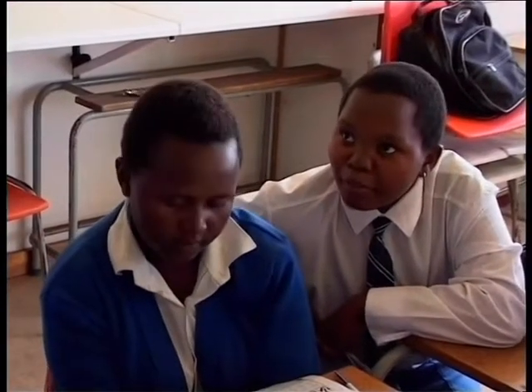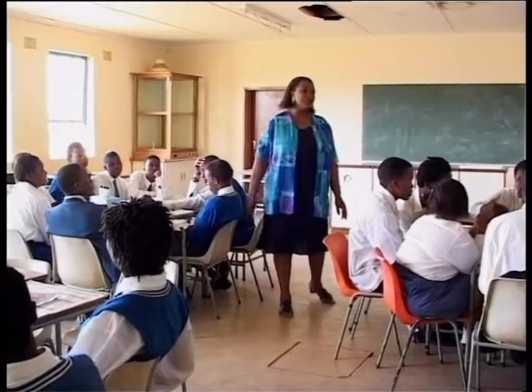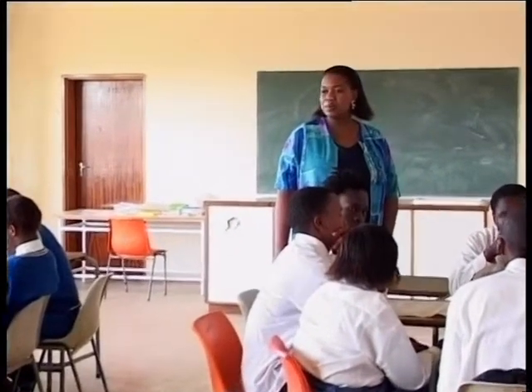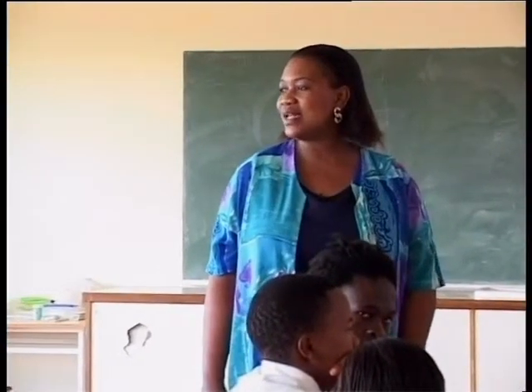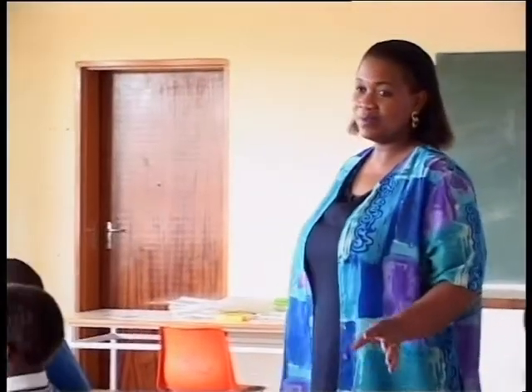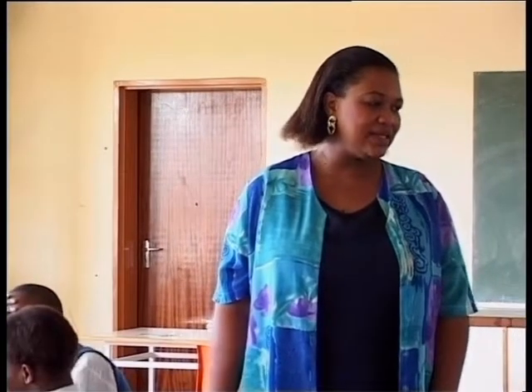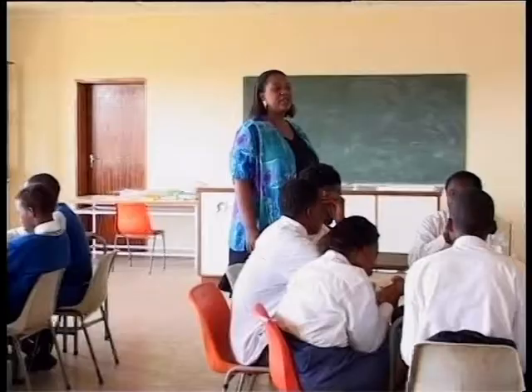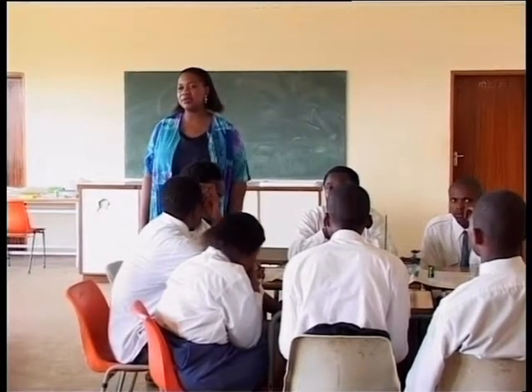When Mrs. Makapela is satisfied with the level of understanding of the learners, they move on to the next stage of the circus and a new experiment. Okay, I think our lesson was very interesting because we're able to manipulate apparatus and make observations on our own, and then we have been able to actually see our redox reactions in action, and we have been able to see also that they can conduct electricity. And then on our next lesson, we'll be doing calculations which involve our electrochemical cells.